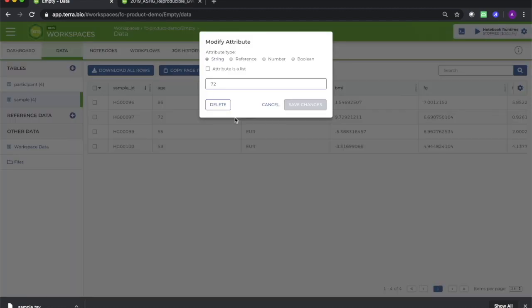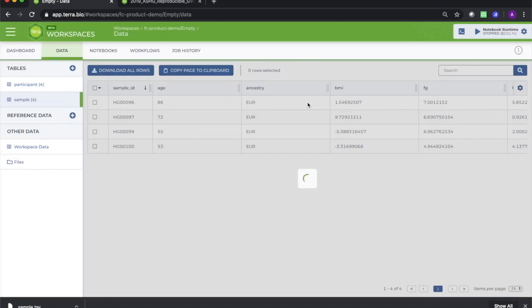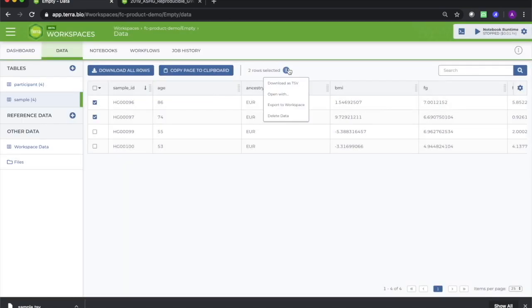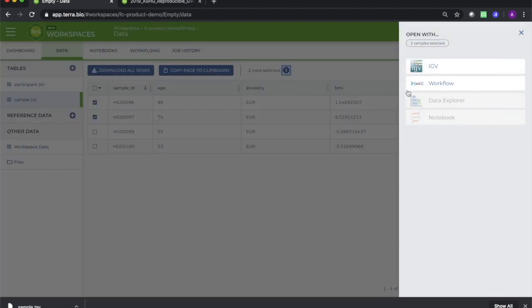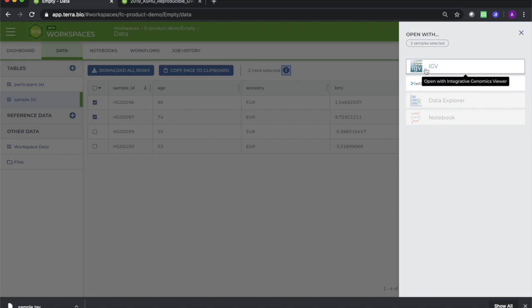Finally, once we have our data tables successfully uploaded, we can launch workflows on this data directly from this part of the interface. As well as in the case of metadata that points to storage of genomic data, we can also launch the Integrative Genomic Viewer, or IGV, to explore directly.